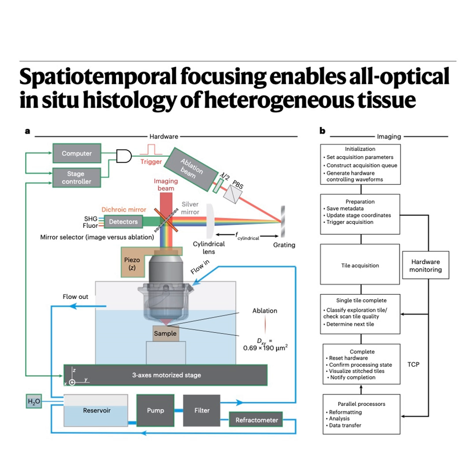the STF system first takes the ultra-short pulse and stretches it out in time using a diffraction grating. This makes the pulse duration maybe 10 times longer or even more. Stretches the pulse. Okay. Then what? Then it uses a special optical setup, what's called a 4F system, involving a cylindrical lens and the high numerical aperture objective lens to reconstruct that stretched pulse at the target.